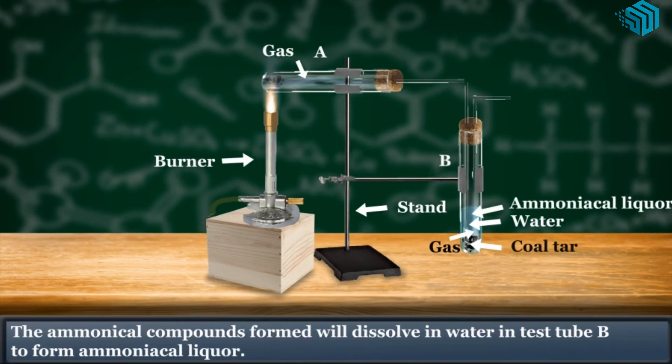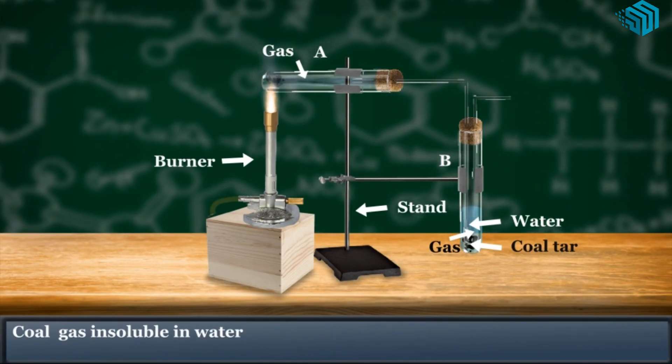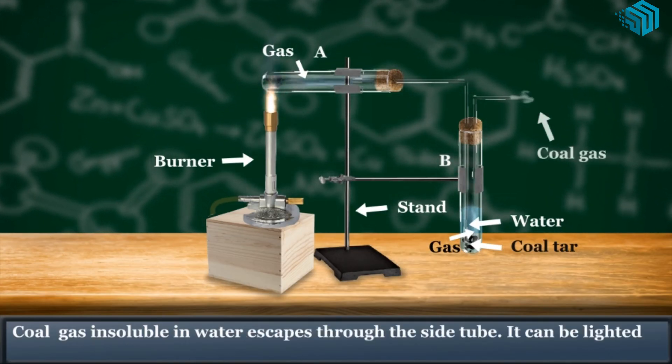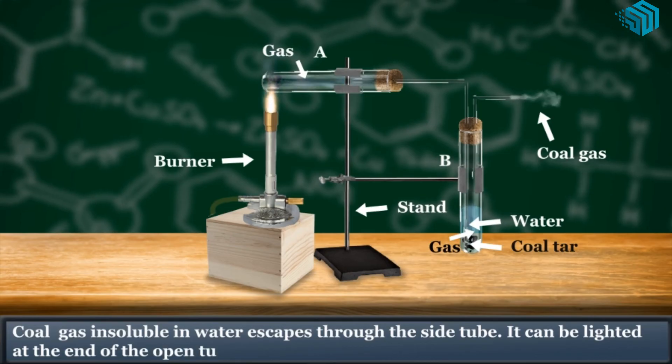Coal gas, insoluble in water, escapes through the side tube. It can be lighted at the end of the open tube.